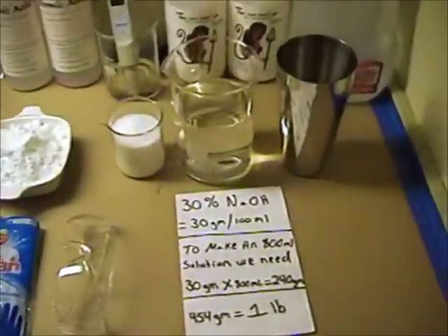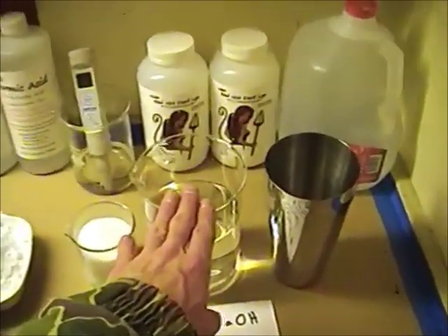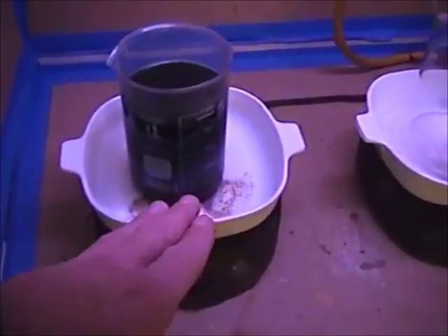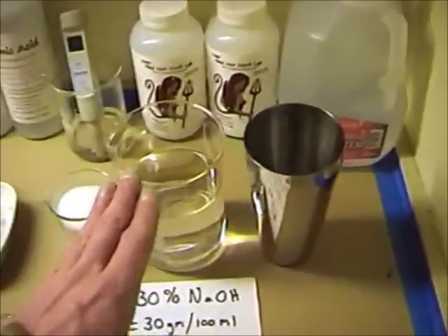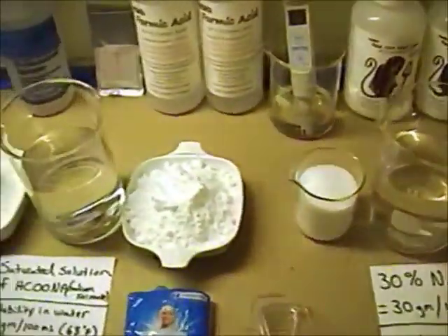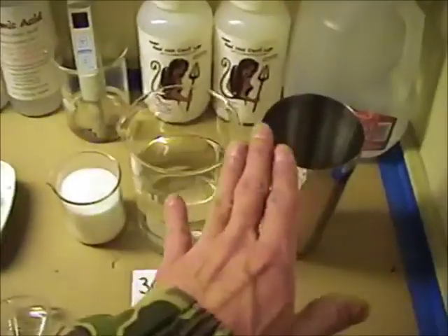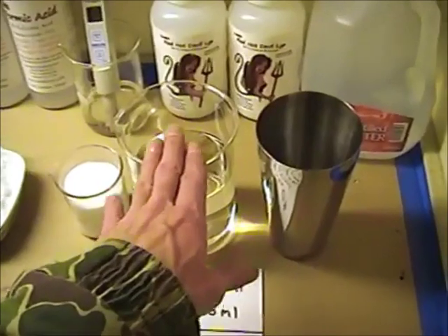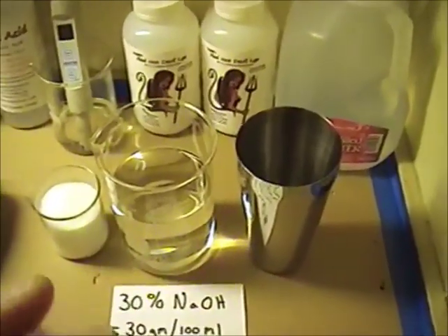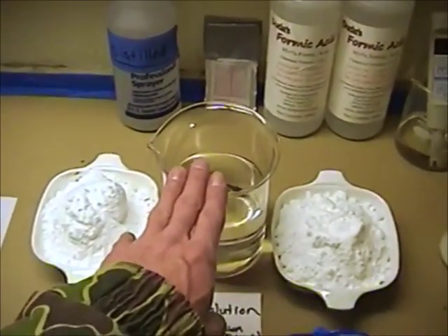Then we're going to come back, and we won't have to filter this solution here because remember, our silver nitrate solution already has some trash in the bottom, so if we have any trash in this, it's not really going to matter. What's going to matter is the sodium formate reduction. After we add the sodium hydroxide and precipitate the hydroxides, we're going to filter again to get us a nice clean solution. And then we're going to add our sodium formate.